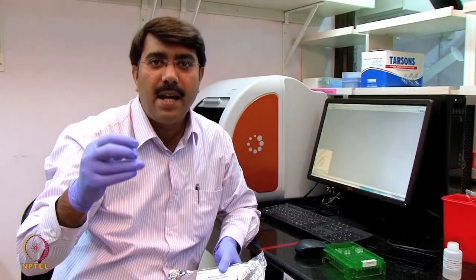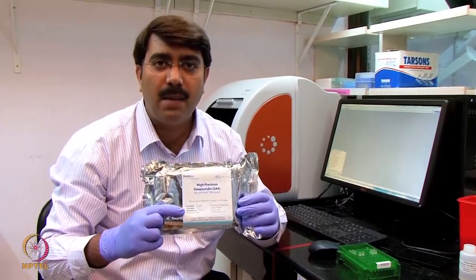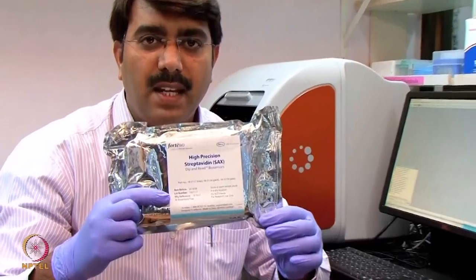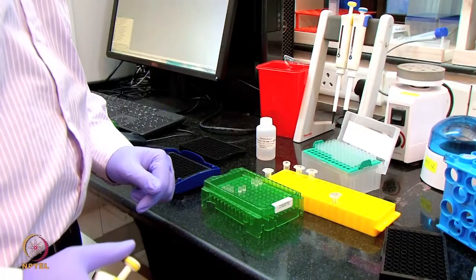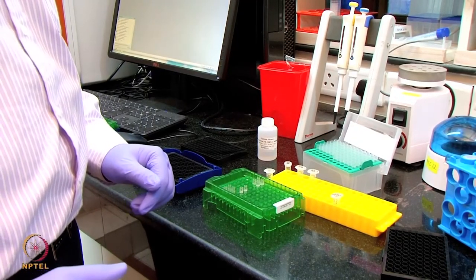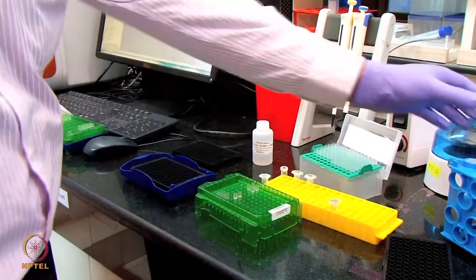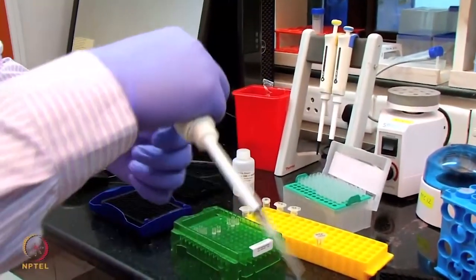The biotinylated antibody, I am going to use for immobilization of the antibody onto a streptavidin sensor. This is the streptavidin sensor I am using for the immobilization step. So here in this experiment, we are using a streptavidin sensor. The streptavidin sensor has to be hydrated for the immobilization. Now I am going to do this hydration of the streptavidin sensors.